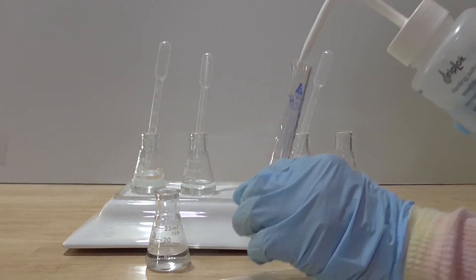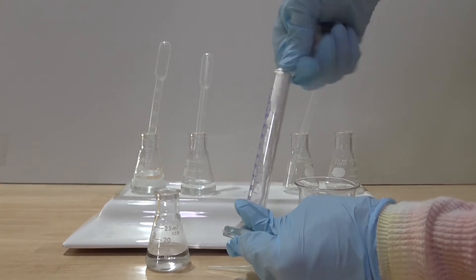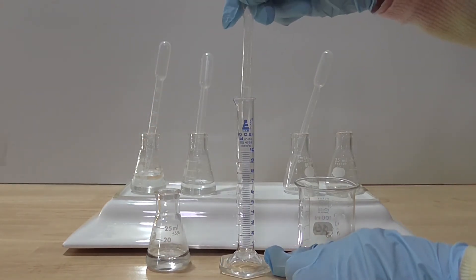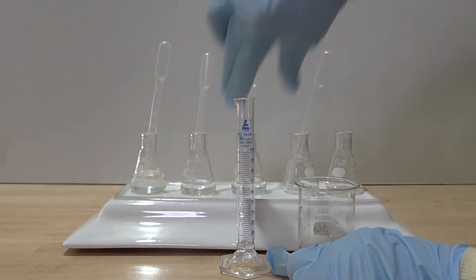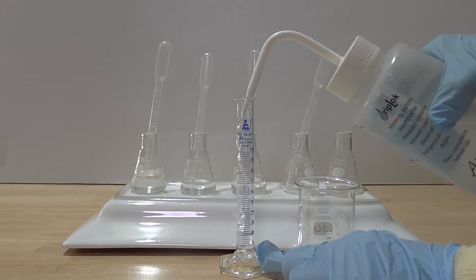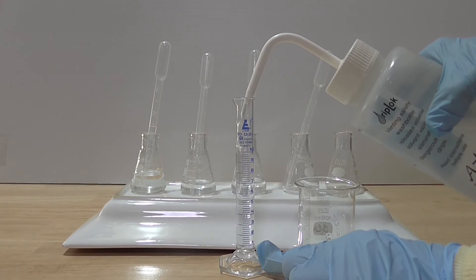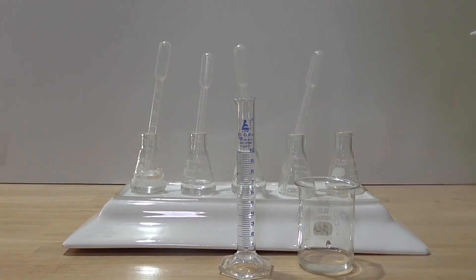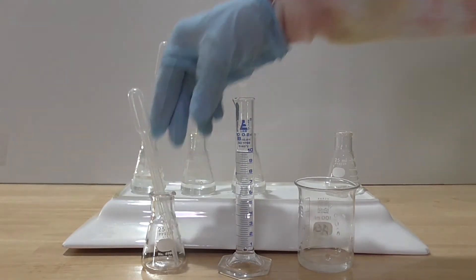I wash and dry the measuring cylinder. I use a clean dry pipette to transfer one milliliter of the 0.01 molar sodium hydroxide into the clean dry measuring cylinder. Pour in nine milliliters of water into the measuring cylinder as well. Ensure the solution is well mixed. The concentration of the sodium hydroxide in the measuring cylinder now has a concentration of 0.001 molar. I pour the 0.001 molar sodium hydroxide into a clean dry glass flask.